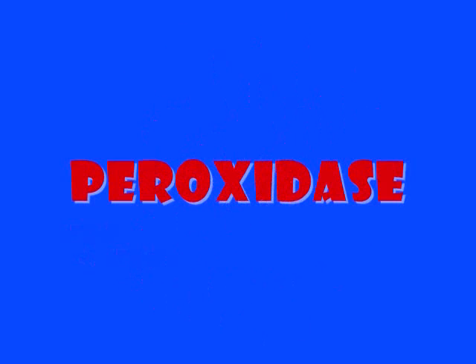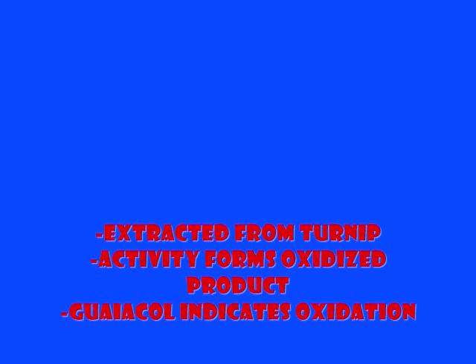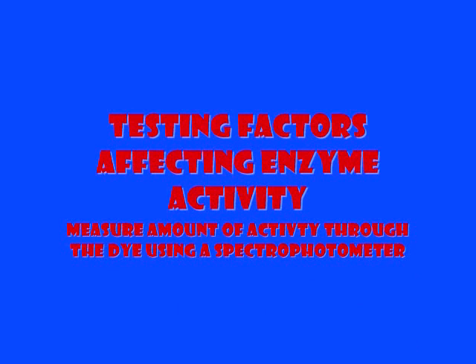The enzyme we will be analyzing is peroxidase. This enzyme is a large protein extracted from a turnip. Using guaiacol as an indicator to detect the oxidated product as it turns brown, we can measure the amount of activity using a spectrophotometer. We will be testing the 3 factors affecting enzyme activity.